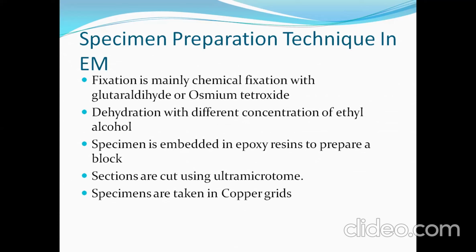I think some of you who have botany or zoology in your subjects also have some experience. In botany mainly, if we are trying to cut sections of thin leaves, we sometimes make a block of potato or carrot and make a slit in it and put the slender material in that slit.